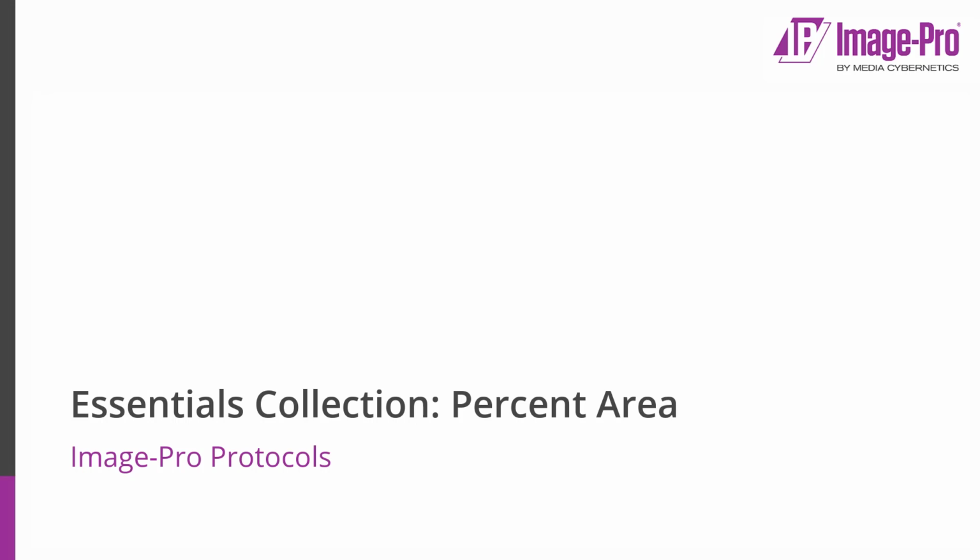In this short video, I'm going to be talking about a protocol from the Essentials collection. This is the percent area protocol. This protocol allows us to measure the percentage area occupied by a class of objects in your images.